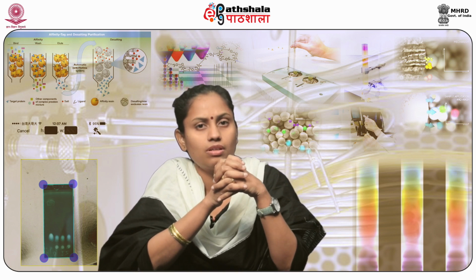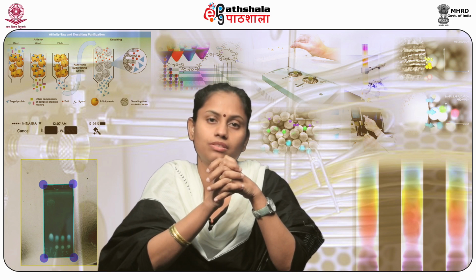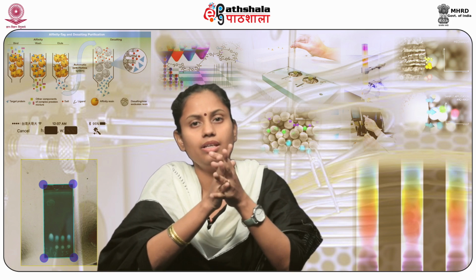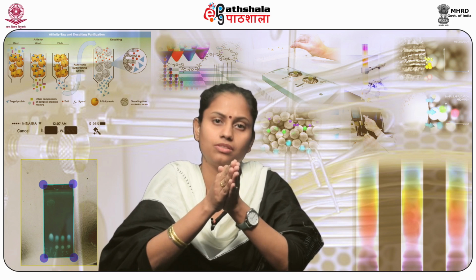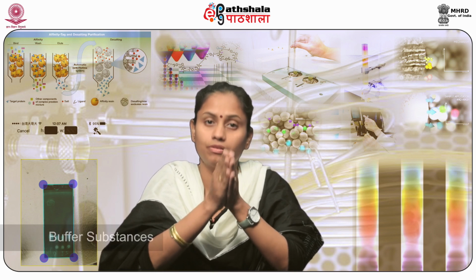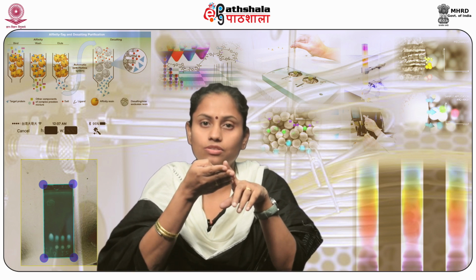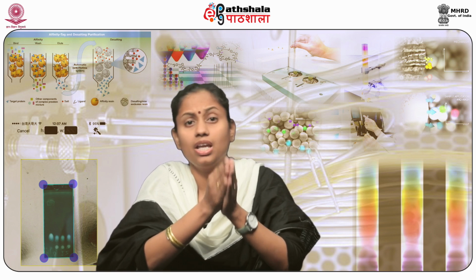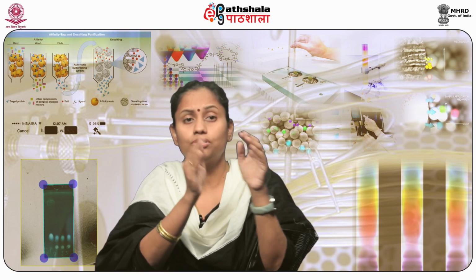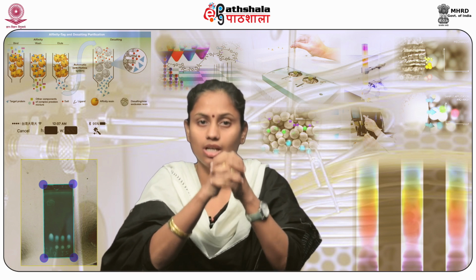Now let's talk about the effect of pH in ion exchange chromatography. When carrying out ion exchange chromatography, it is very important to control pH, which depends on the buffer substances, salts, sample components, organic solvents, and temperature. For optimum separation, each of these variables should be considered individually and in relation to each other.